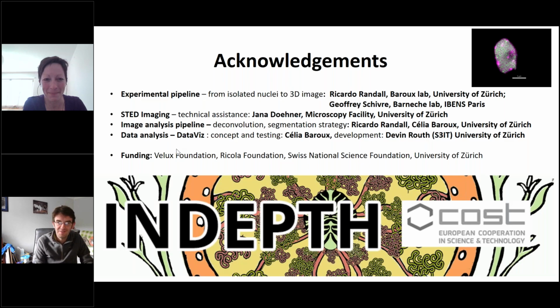Yeah, that's lovely cross-posting there. If you look on the INDEPTH Academy page, there's a webinar from a few weeks ago from Christophe, where he explained their new version of nucleus-J. Yes, thanks. And what Dimitar Prodanov presented last week is also an open source algorithm that allows to segment, I think, the chromocenter. I haven't tested it myself, but that would also do the job. So there are a few possibilities for that. You can still do it with IMARIS. I don't say you don't have to do it. I just wanted to say there are other possibilities.